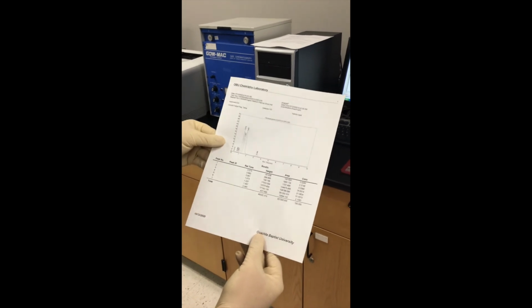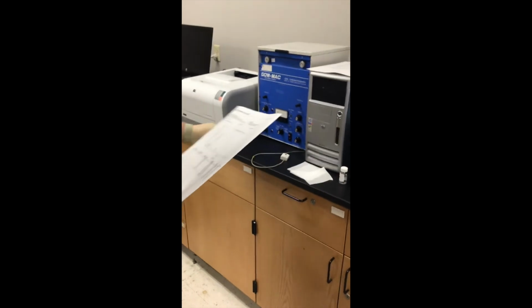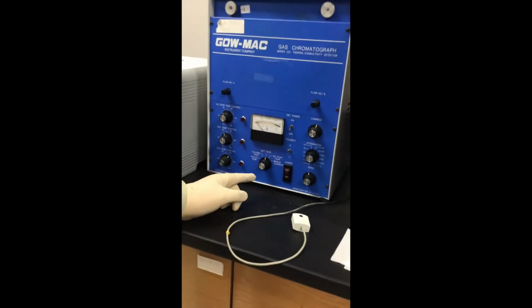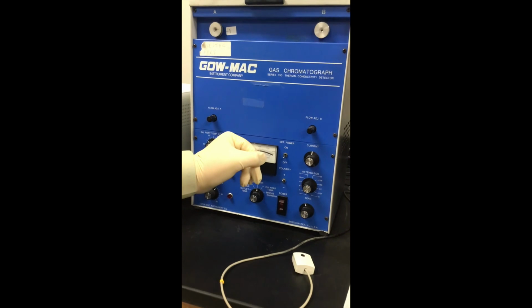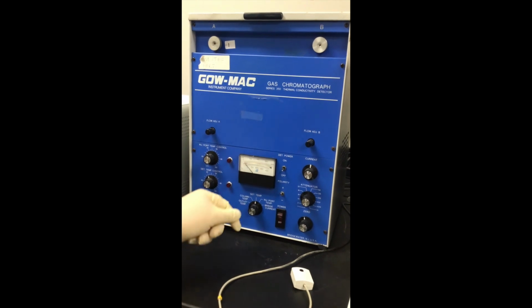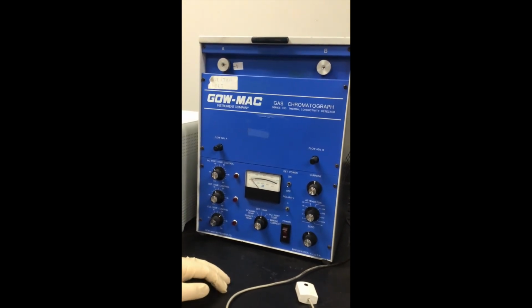You will need to collect the information about the GC before you leave. In these little viewports, it will tell you what temperature things are at. In this case, it's most often set to the detector temperature. So if this were on, it'd be somewhere up in this range, I think. Yes, it'd be somewhere up in this range for the detector temperature. And then you could change it to take all of the other temperatures, like the column and the injection port. And then you have to record all this data to prepare for your laboratory report.